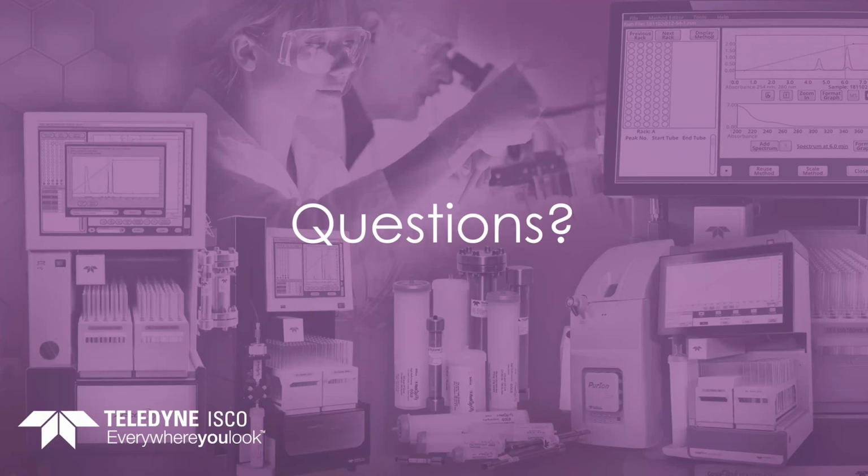Well, everyone, thank you for your time. And the first question is, what do you do with columns that do change with solvents? Solvents such as ethyl acetate and 5% water and alcohol are unusual, so people only use them as they need to. If I need to run columns under such situations, I label them so that I only use them with the special solvent in the future.